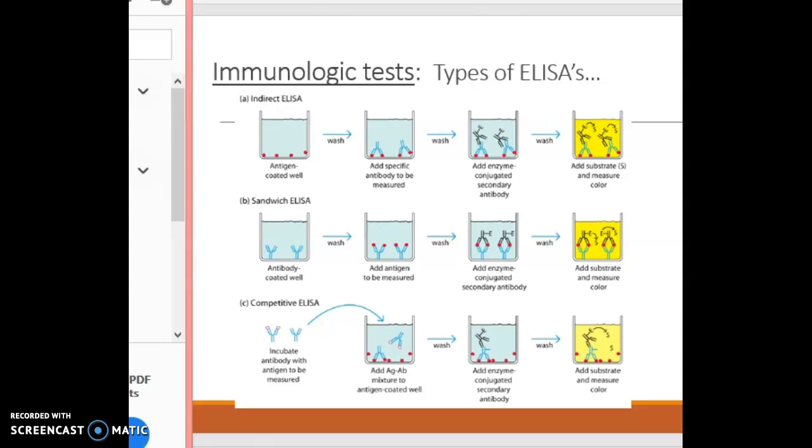There is one more variation of ELISA, which is the ELISpot assay. This ELISpot assay allows the quantitative determination of the number of cells in a population that are producing antibodies specific for a given antigen, or an antigen for which one has a specific antibody. In this approach, the plates are coated with the antigen recognized by the antibody of interest or with the antibody. This is one more variation of ELISA, called the ELISpot assay.